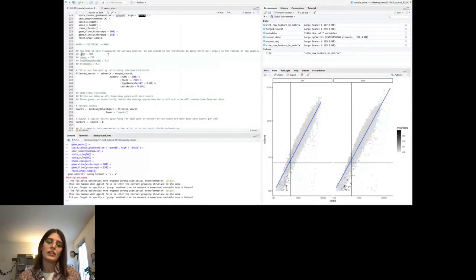Then, based on the type of cells that you are analyzing, you can adjust the thresholds. And these are very important because based on these thresholds, you decide whether to keep or discard a cell for the following analysis. So if you are too relaxed in these thresholds, you end up with many junk cells, which kills you in the differential expression analysis, for example, but also in the clustering, they cause many problems. If you are too restrictive, it could be that you end up with a very restricted number of cells, so it is difficult then to make an analysis.